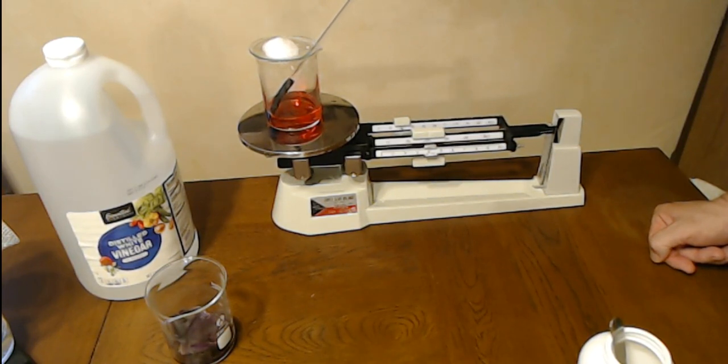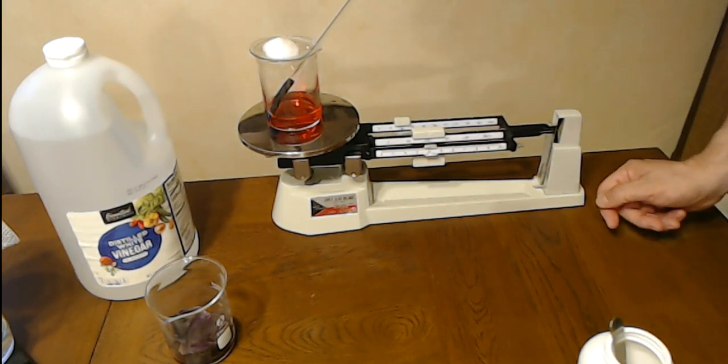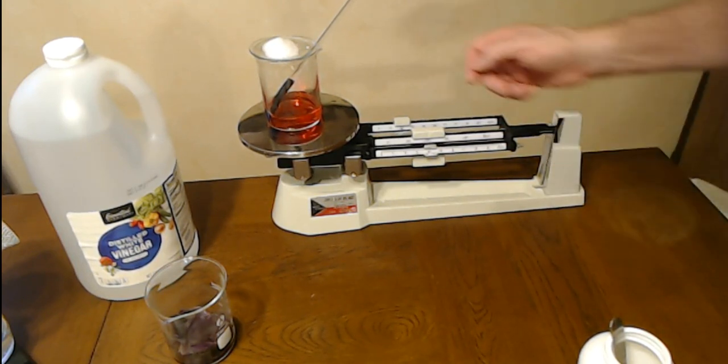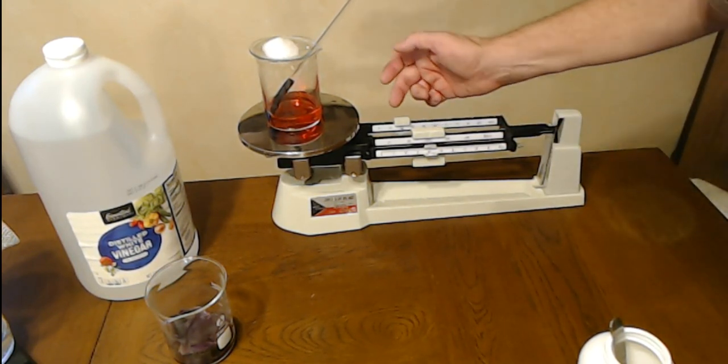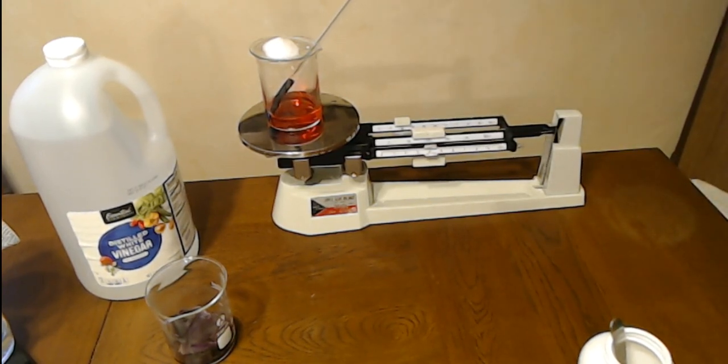Almost stopped. Okay. Maybe just a hair low, but we're just going to remember we're a hair low. We're going to go off of here. So we got 224.2 grams. So we're going to record that as our beginning mass. So go back to your lab book.